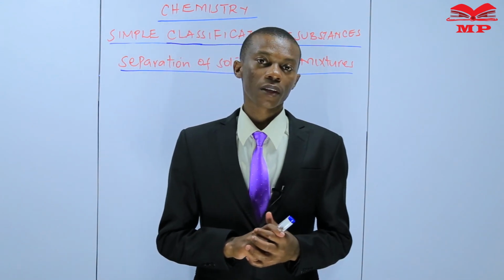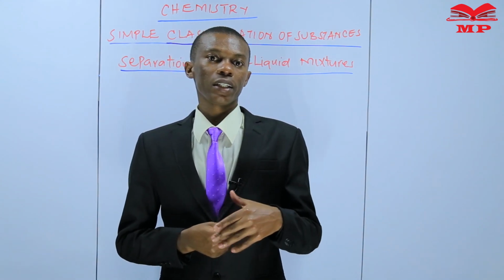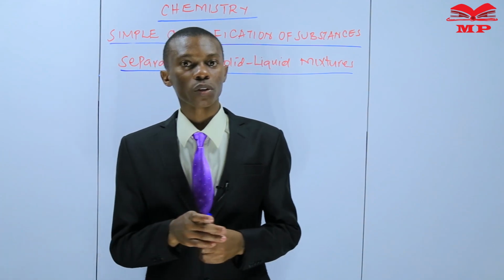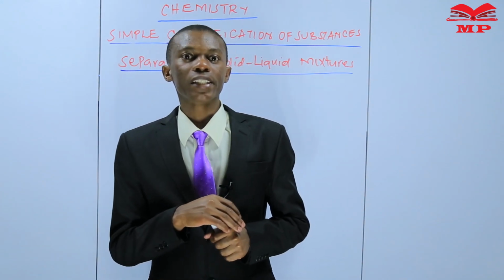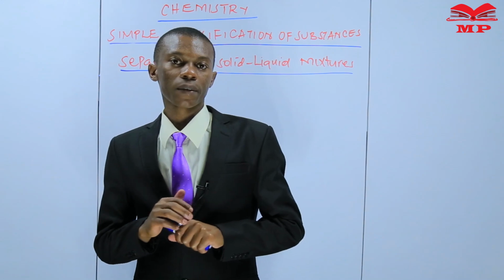In this lesson, by the end of this lesson, you should be able to explain and conduct a filtration process.